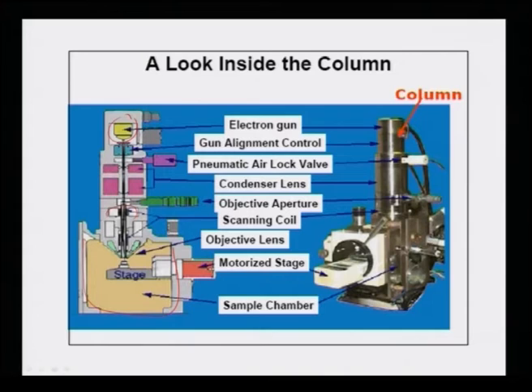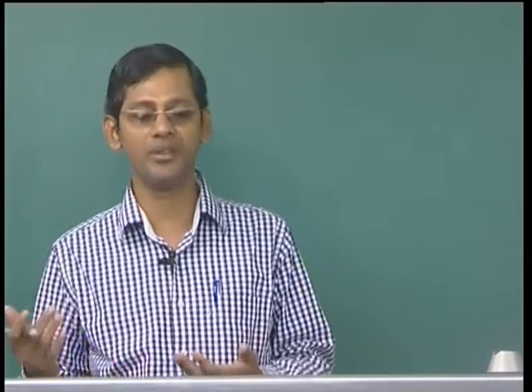There you can fit a lot of things. As I discussed with you, when the electron beam falls on a sample, it interacts with the sample and generates all kinds of information, starting from secondary electrons to backscattered electrons to X-rays, or maybe other information like Auger electrons. Everything is possible to obtain. Depending on the type of detector used in the scanning electron microscope, you can use these signals to obtain images, and these images can be further studied.